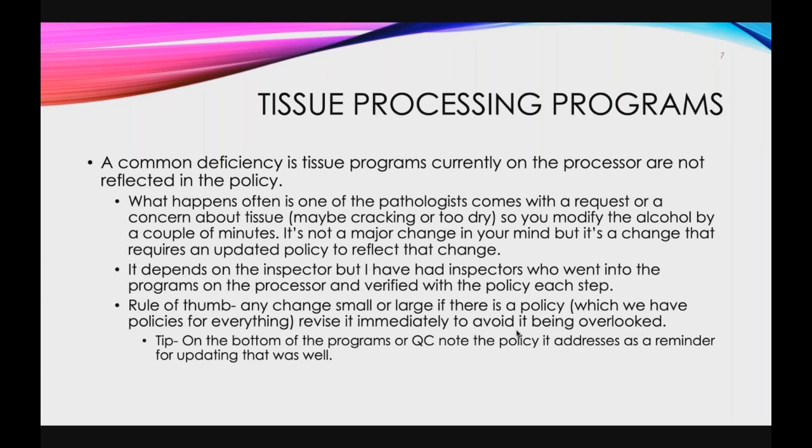This will happen during the initial tour. They'll look at the tissue processors. They may ask you first, did you change any tissue processing programs? If you say no, they might fall back on it later on. But this is something that I just wanted to mention, because to us, even if it's 1 to 2 minutes, it doesn't seem like much, but if it's any sort of change, it has to be reflected in a policy, and you would have to do a validation of it. So it is very important that the pathologists also realize we can't just tweak it a little bit, unless it's a real major issue that you see happening over time.